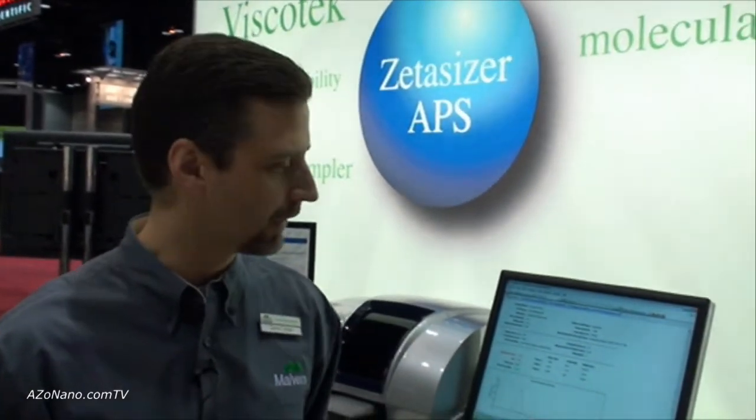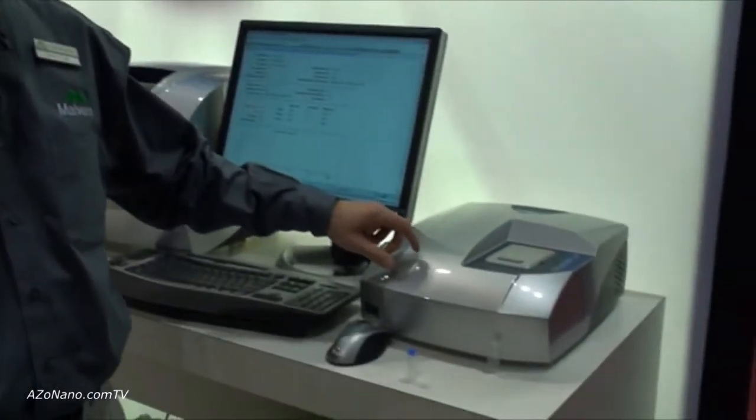This is Cameron Chai from azonano.com and I'm speaking to Dave Dolak from Malvern Instruments. He's going to tell us about their Zetasizer particle size range. We're introducing two new products here at PitCon this year. One is the Zetasizer Micro V.